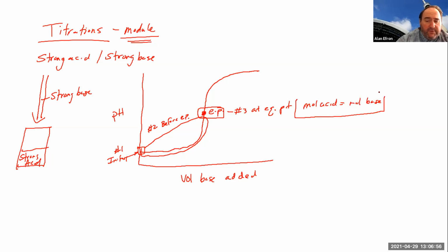So when we do a regular titration, not making a titration curve like we're going to do in this experiment, but with the goal of finding something like the molarity of an unknown, that's usually the point where we would want to stop. Because at that point the reaction is technically over. We've got equal amounts of moles of acid and base. So again, a very important part.